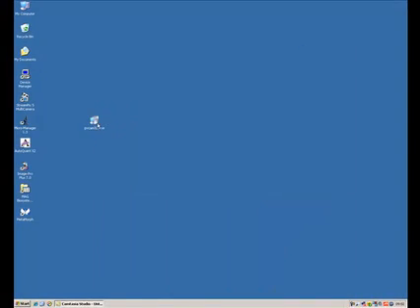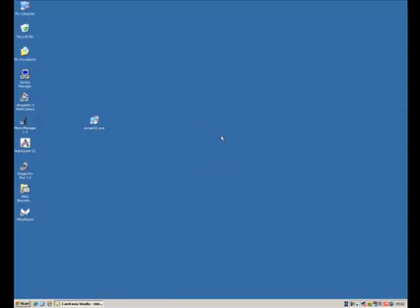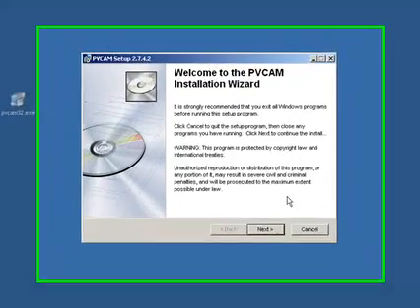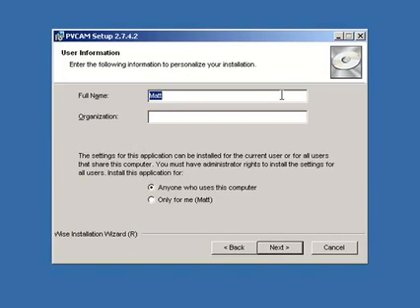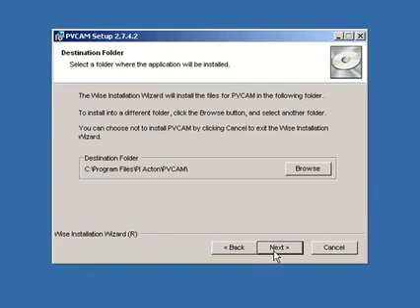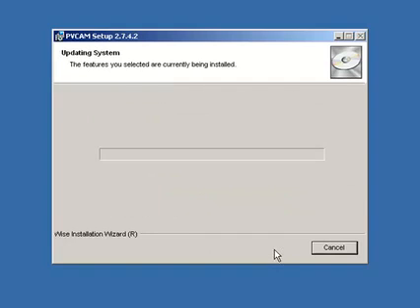Okay, now we're ready to install the software. So I've got Princeton Instruments PVcam here, which is just an executable we can run. And I should point out the Pro-EM cameras come with a GigE card to talk to the camera, and I've already installed that in the machine. So let's just install the drivers for that.